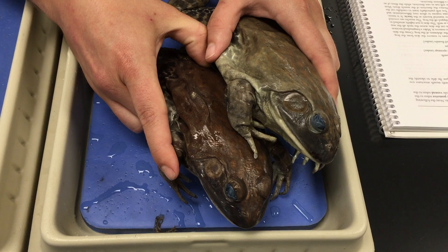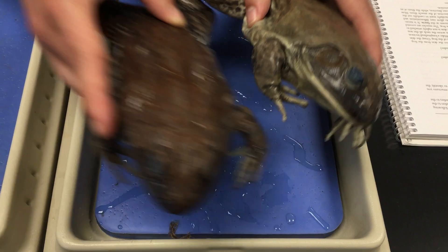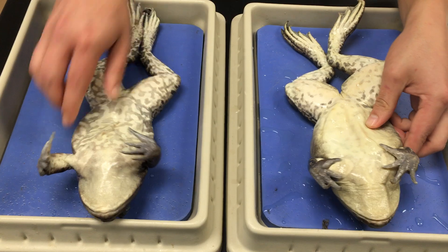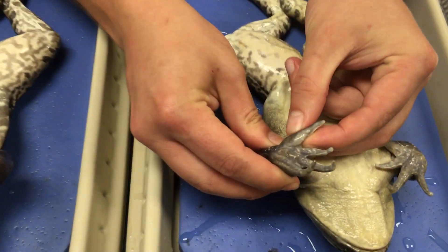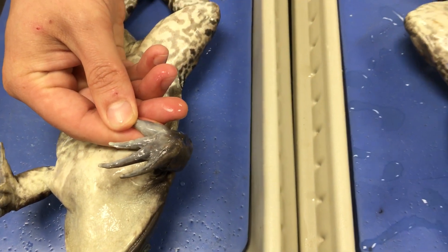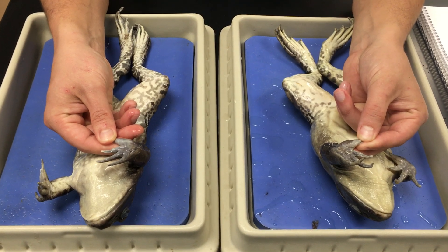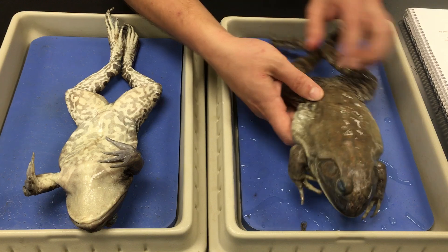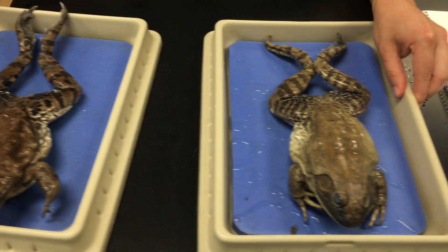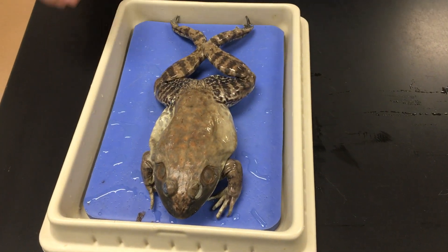The tympanic membrane is essentially an external eardrum. Another way that you could tell is by looking at their thumbs. Very often males will have enlarged thumbs relative to the females. That helps them grip the females during copulation, which in amphibians is called amplexus. So now that we have how to determine the sex of the bullfrog using those external characteristics out of the way, we're going to focus on the male because it's bigger and we can see these things a little bit more easily.